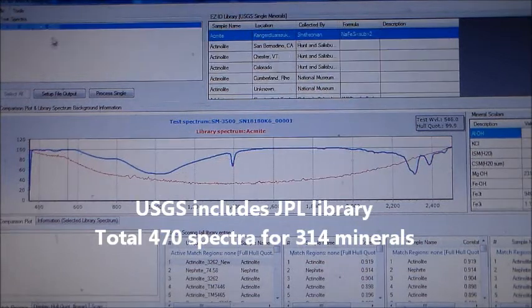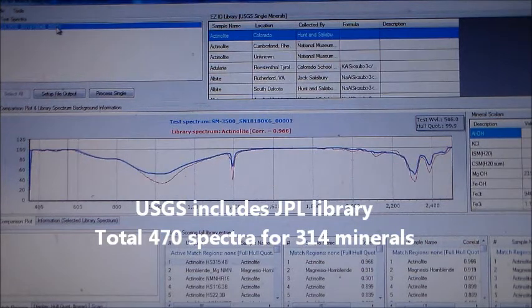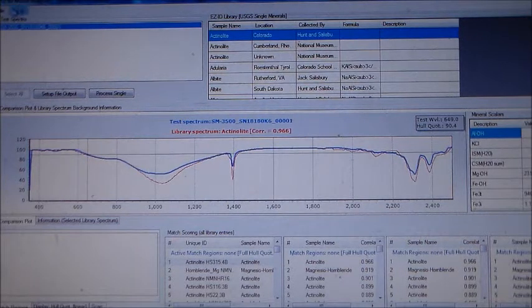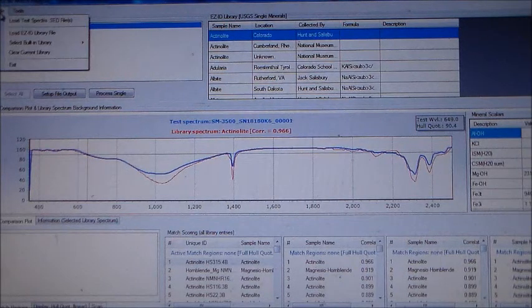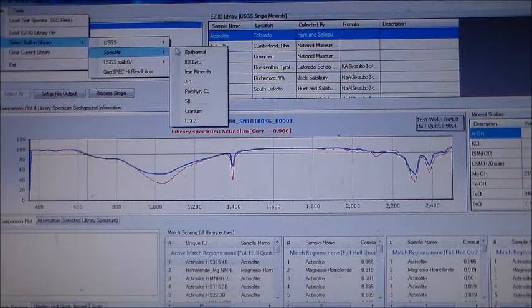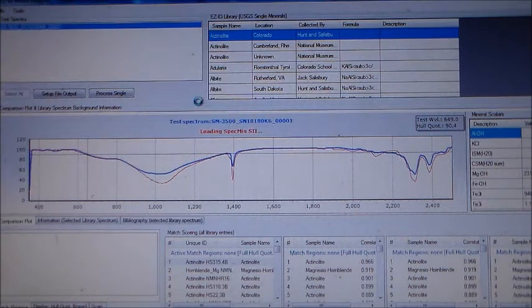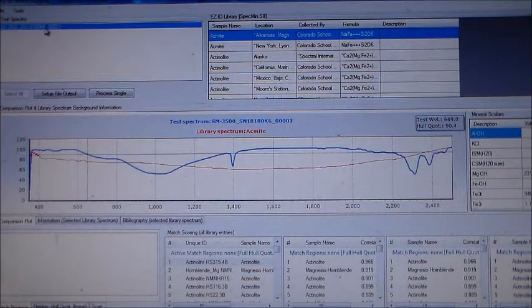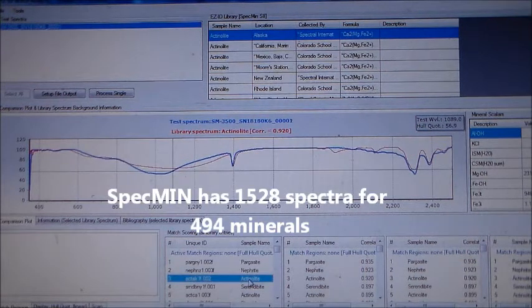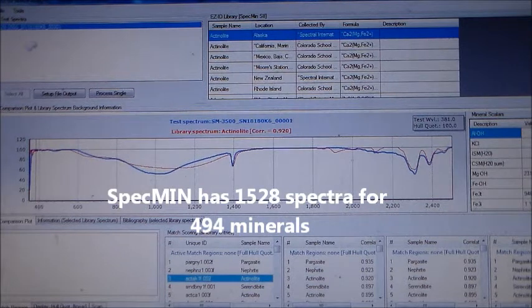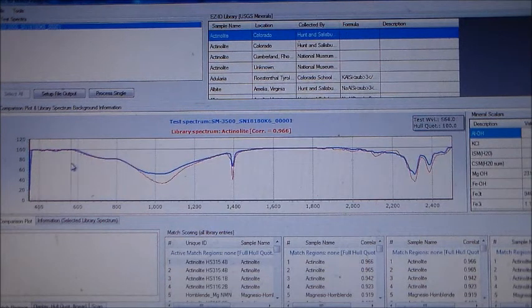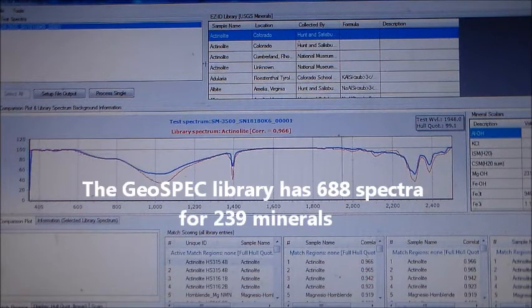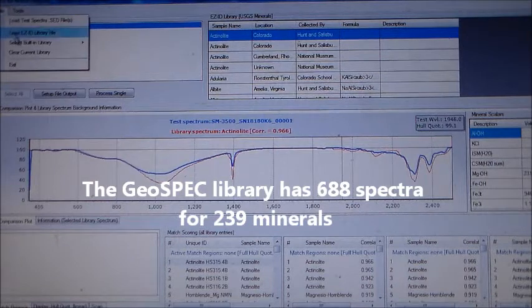In addition, there are two optional libraries: the Specmin library and the GeoSpec library. Specmin has 1528 spectra for 494 minerals. The GeoSpec library has 688 spectra for 239 minerals.